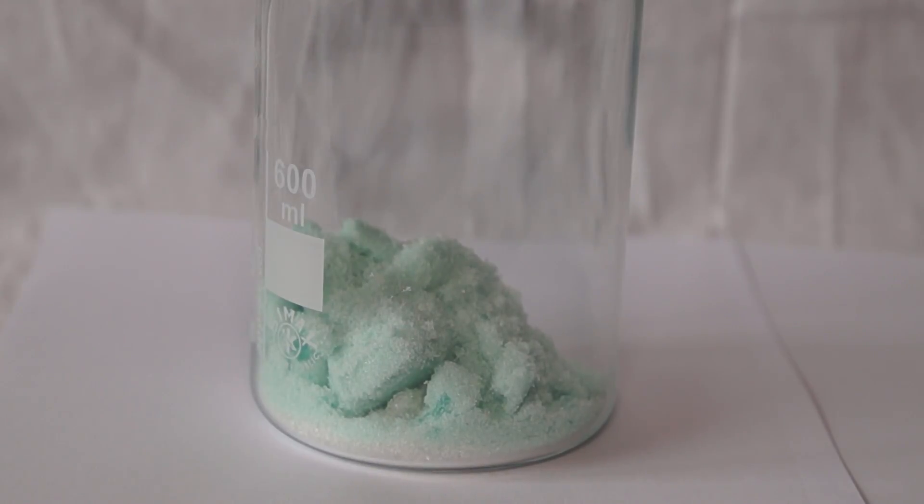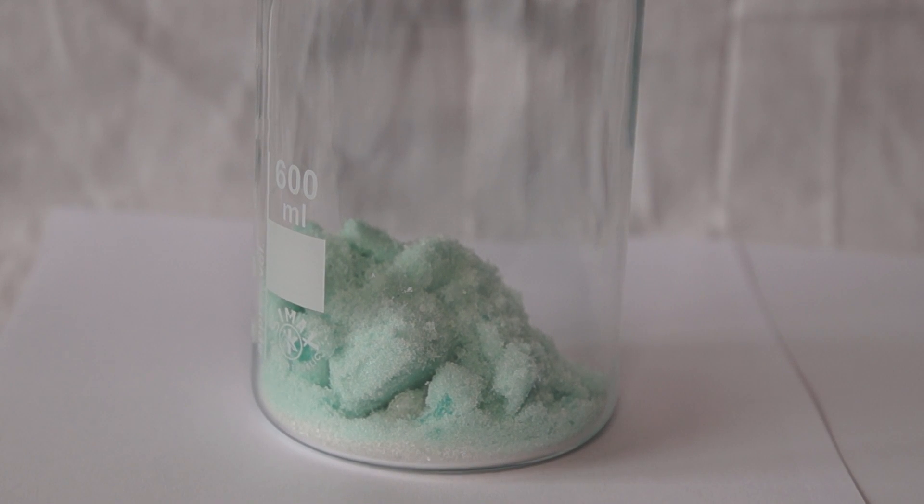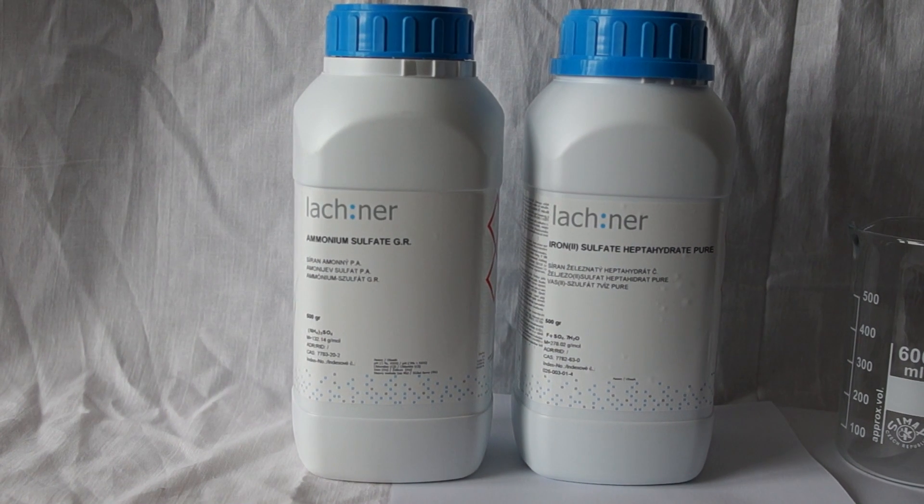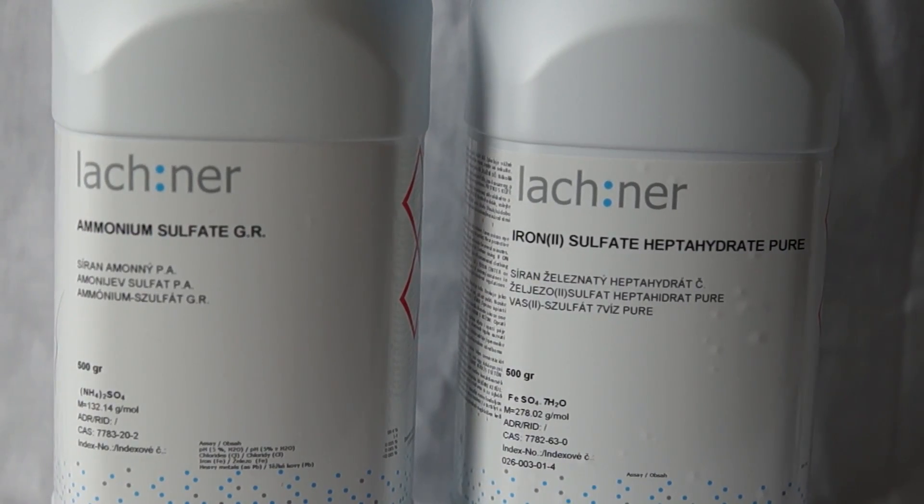Hello everyone, today I'll tell you how to grow a green crystal of Mohr's salt. Mohr's salt is a double salt of iron ammonium sulfate. To prepare Mohr's salt, you will need iron sulfate and ammonium sulfate. These substances can be bought in a chemical store or via the internet.